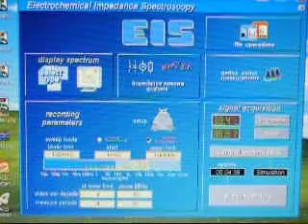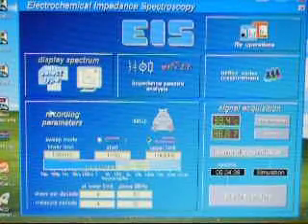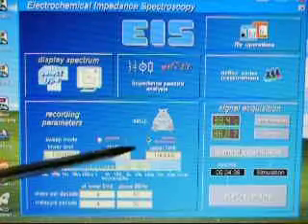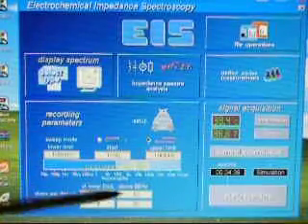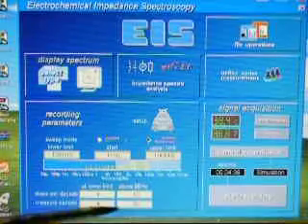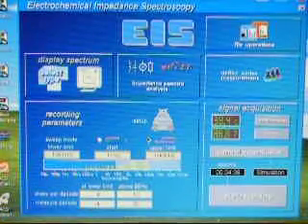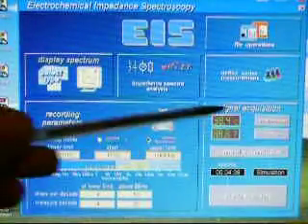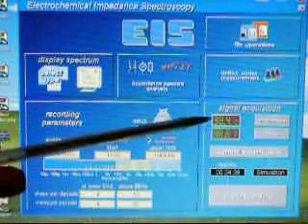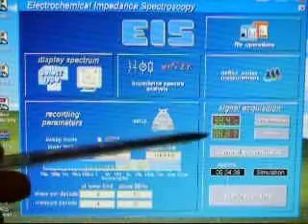The screen in the bottom left shows the setup parameters for the sweep: its lower limit, starting point, and upper limit. We can show how many steps per decade above and below 66 Hz to cutoff, with number of measurement periods above and below. Signal acquisition allows us to use the plug-in modules into the Zohner Zennium mainframe, for example showing degrees C or voltage.